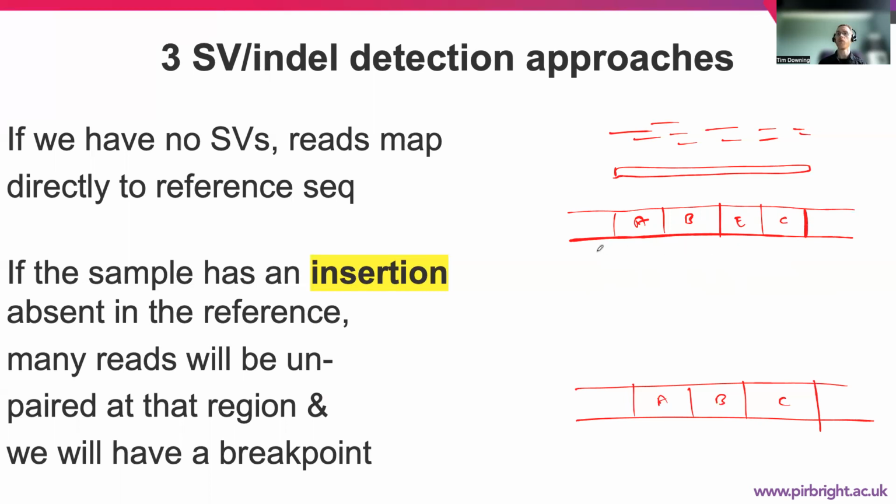So we know that if we have reads coming from here, we're dealing with paired end reads. So I should actually make them longer. That's the wrong way around. Forward and reverse here. Forward and reverse reads all the way through, even if my diagram is a bit poor. We're imagining that we're pulling reads from this region where each of these regions is longer than a single fragment.